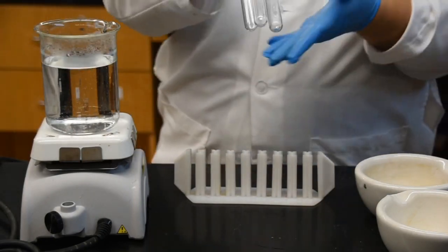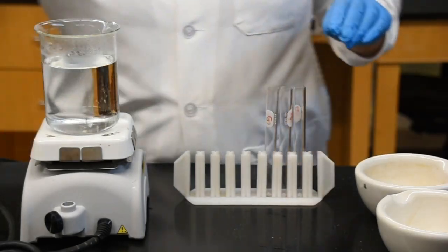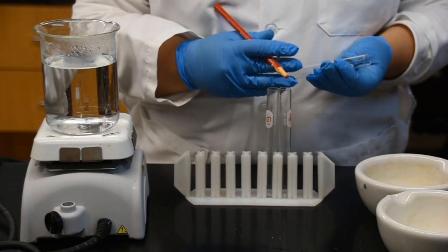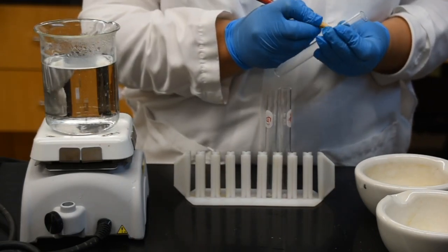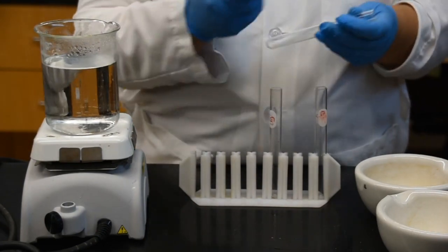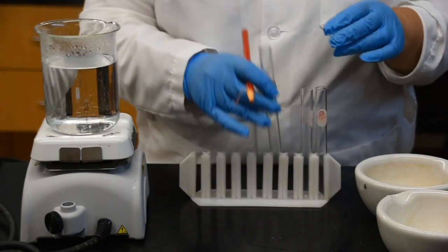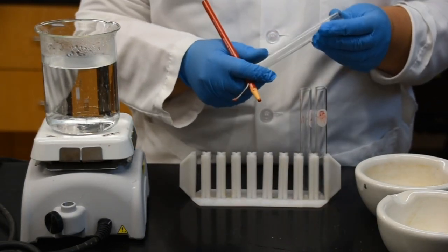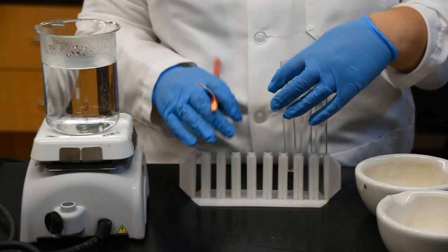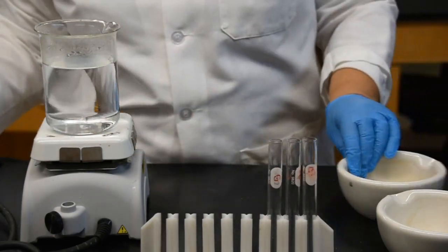So here I'm grabbing 3 test tubes. I'm going to use my wax pencil and label each of these. The one that is going to be testing for simple sugar, I'm going to label with B for Benedict's. The one that is going to be testing for protein, I'm going to label with N for ninhydrin. And the last one, which is identifying the starch, will be using Lugol's iodine, so I'm going to identify that with L. Now again, we're testing each sample for the 3 possibilities.